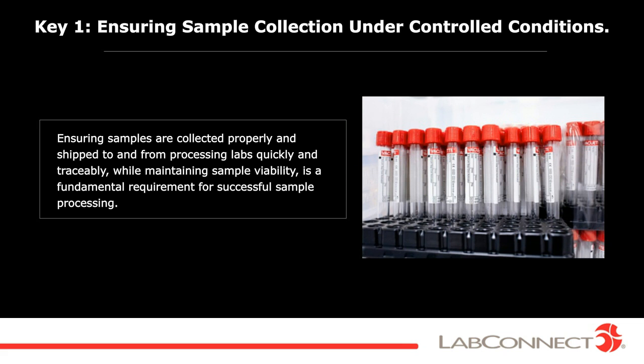Ensuring proper collection and shipping of samples is imperative. With sample processing, there's a focus on viability of cells and also stability of different markers that may be of interest in a clinical trial. These all require timely shipping as well as proper shipping conditions.